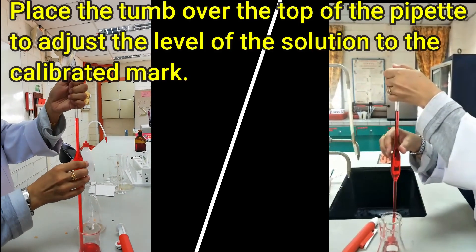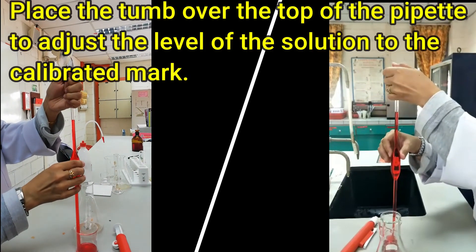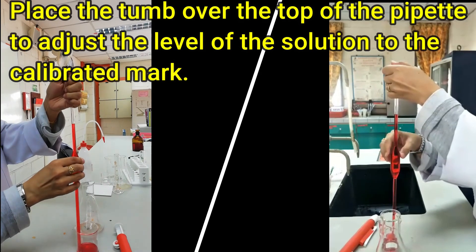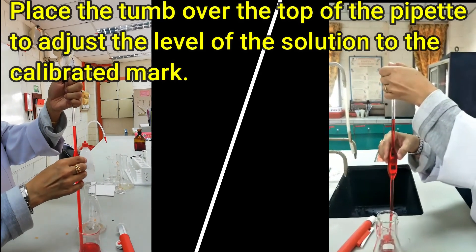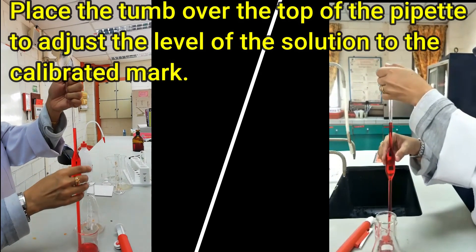Place the index finger or the thumb over the top of the pipette to adjust the level of the solution to the calibrated mark.